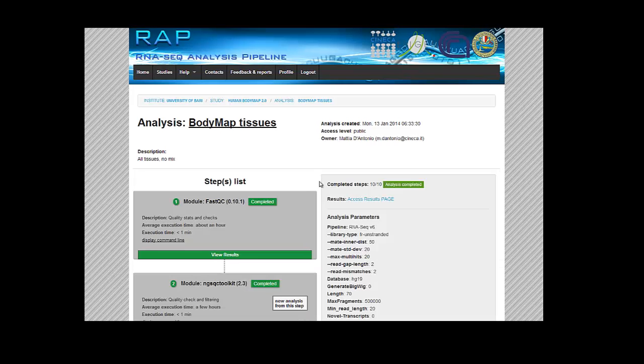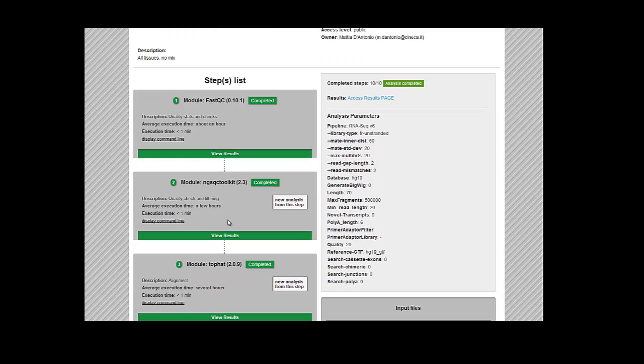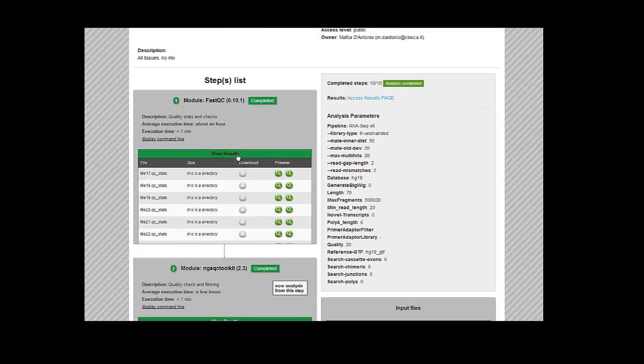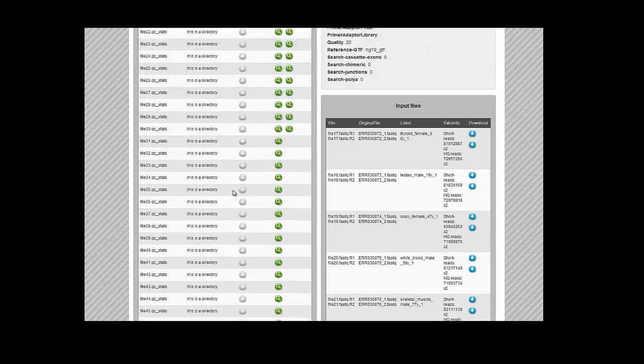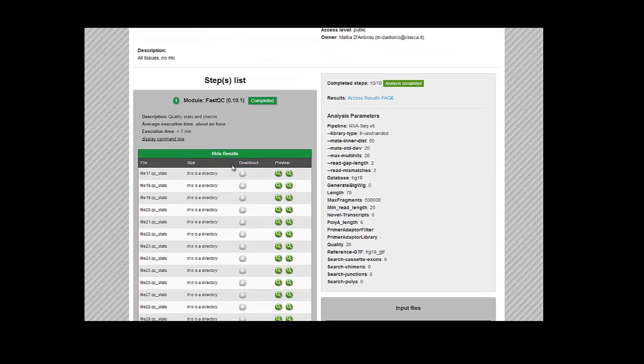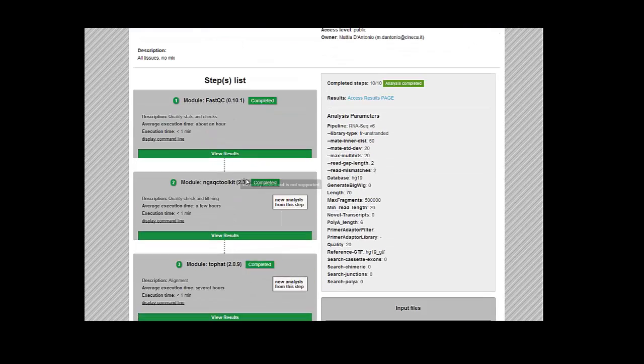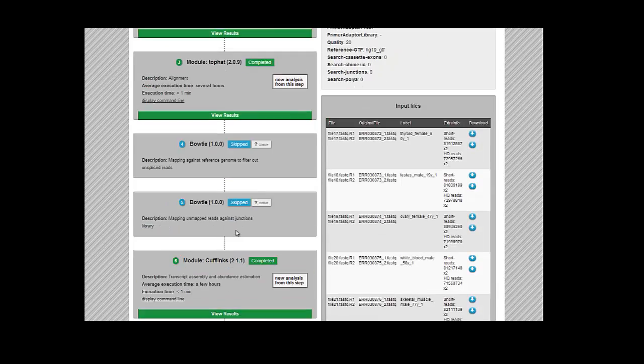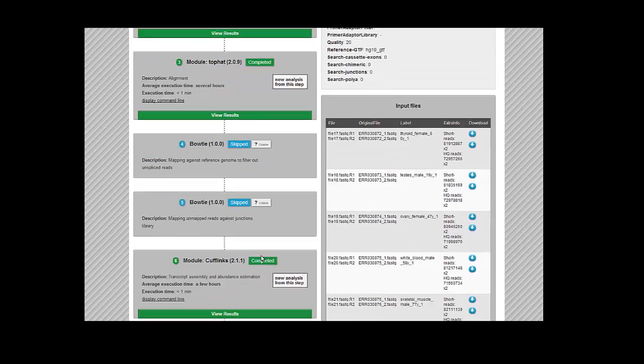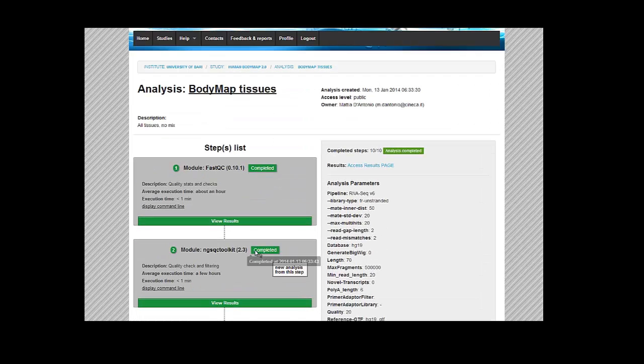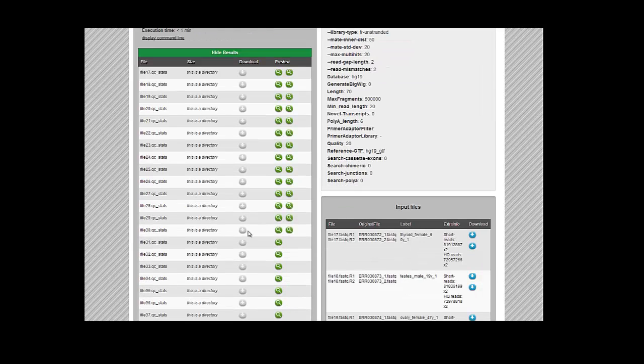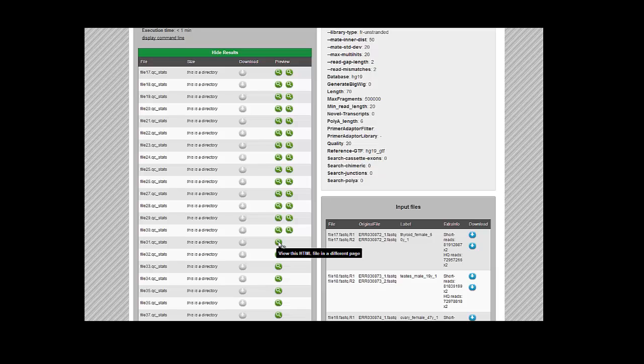So here we have, as I was saying, all the steps and they've all been completed. You can click on the View Results button. So here you have all the steps—they've been completed and they're all green except the skipped ones. And you can click on the View Results button where you can download the intermediate files.